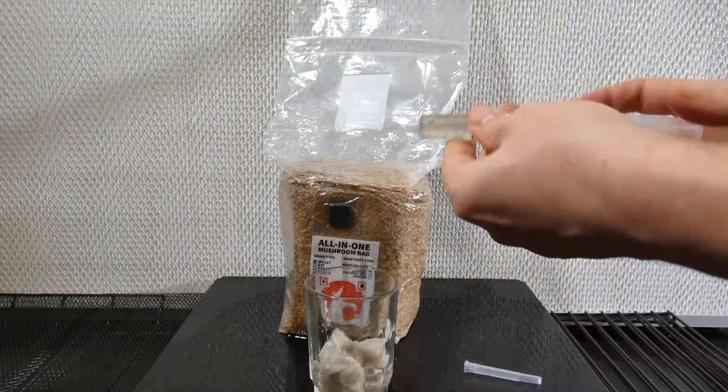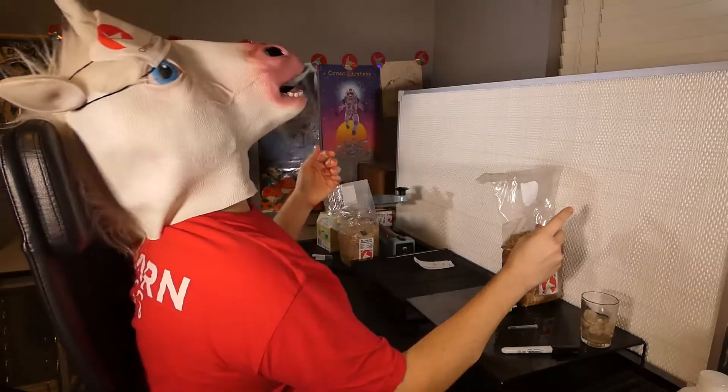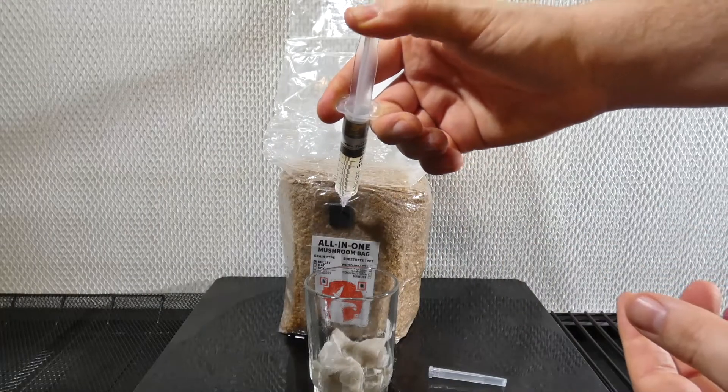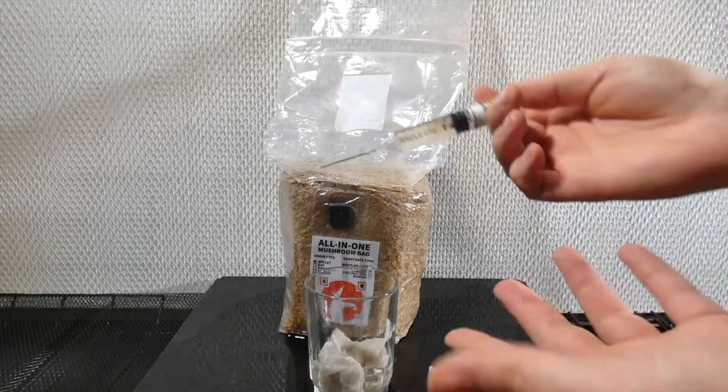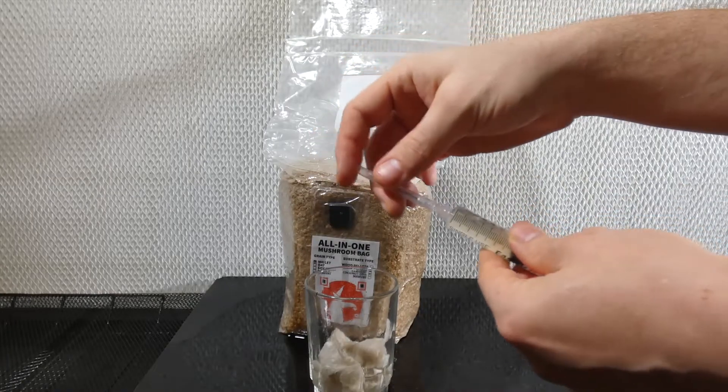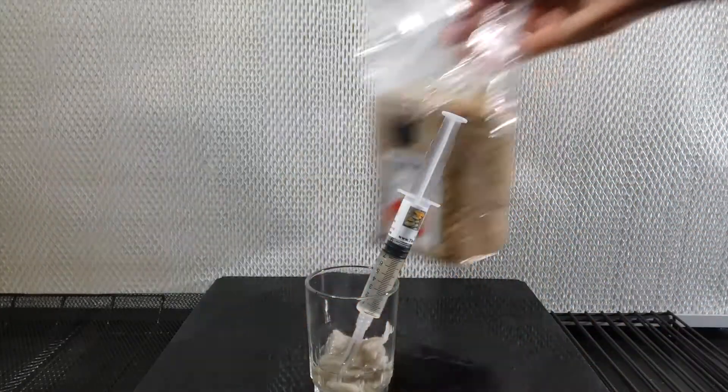Remove the cap from the needle. You don't need to sterilize it since it came sterile from the medical supply factory. After injection, replace the cap so you don't stab yourself. This step is optional, but it makes life much easier and safer.